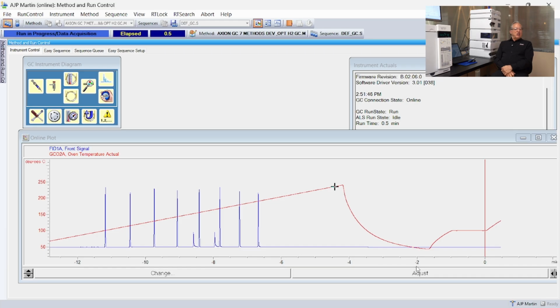There's a chance that those peak shapes clean up too. I'm just saying this off camera. This doesn't have to be part of it. Or it could be part of it. Why would they clean up? Yeah, so I'm hoping the peaks might be better looking this time. And why would that happen?